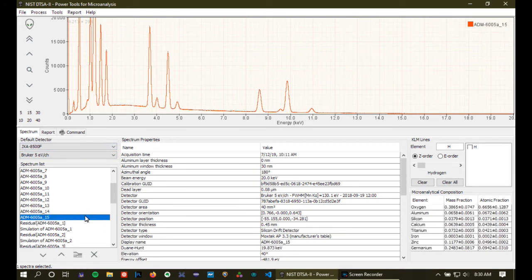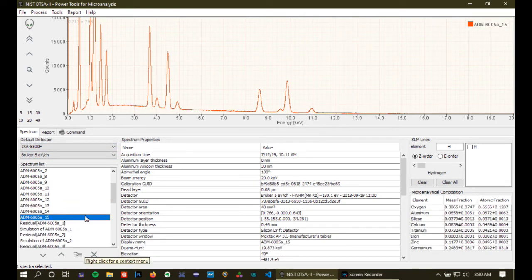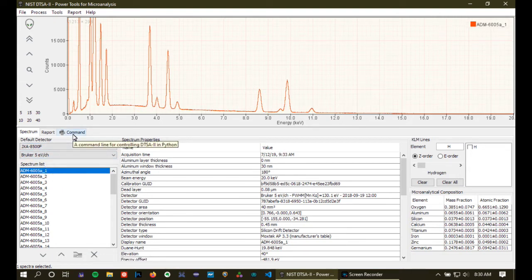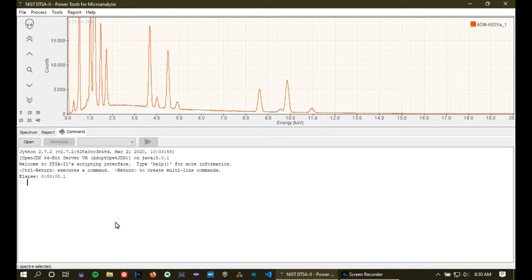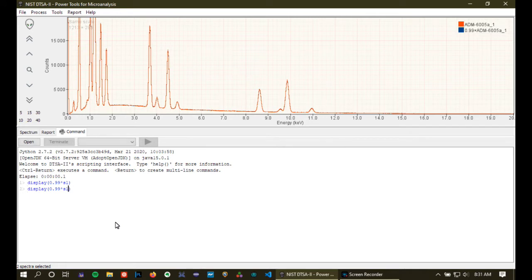All right, so I'm going to go back again and I'm actually going to do one more thing. I'm going to construct some spectra to demonstrate one of the features. And I'm going to do that from the command line. I'm going to construct a spectrum that has 99% of the intensity on one of the standards.